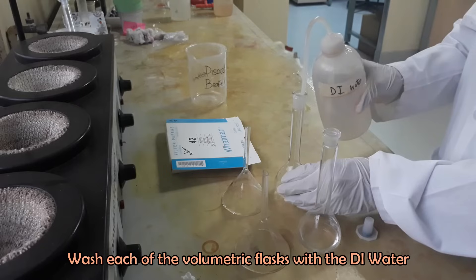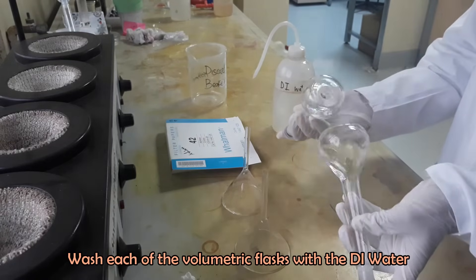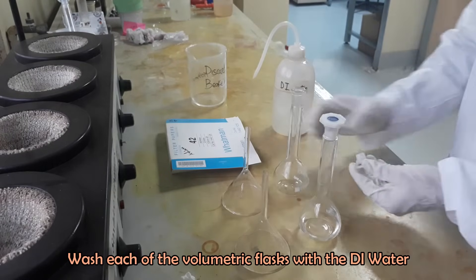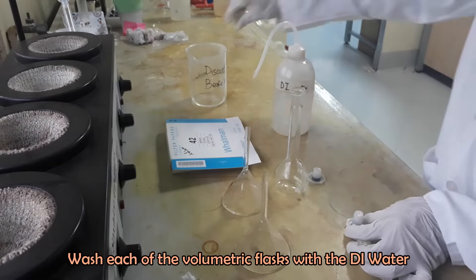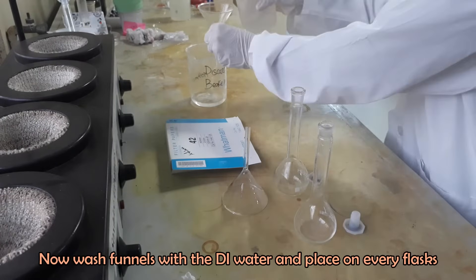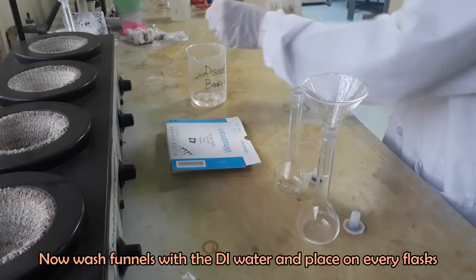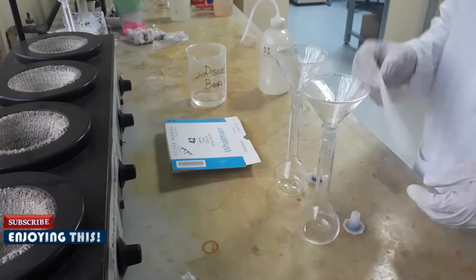Wash each of the volumetric flasks with deionized water. Wash the funnels with deionized water and place one on each flask. Fold Whatman filter papers and place them on the funnels.